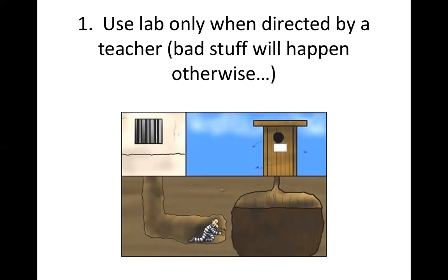Do not do it alone or by yourself, because this will prevent accidents from happening, especially if you will be using fire or heating some materials as part of the experiment. Please don't do them alone. Always do it when you are with a teacher, when it is approved by the teacher, and when you are supervised by an adult. Okay?